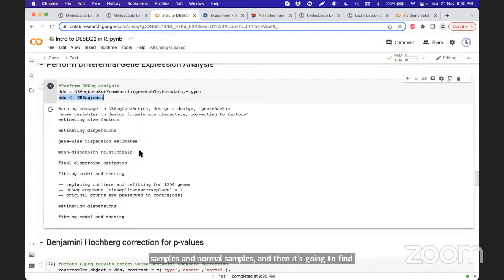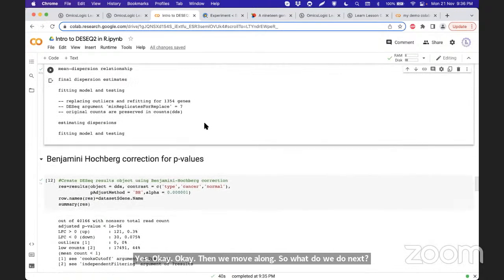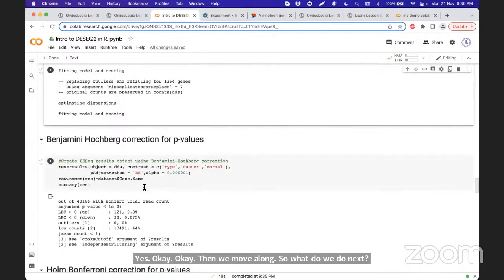Why is it not working for you, Hervé? What's the output that you get? What are you getting as an output? Is everybody else able to finish this? Yes, yes, okay. Okay, then we move along. So what do we do next? Yes. Yeah. So what do we do next?